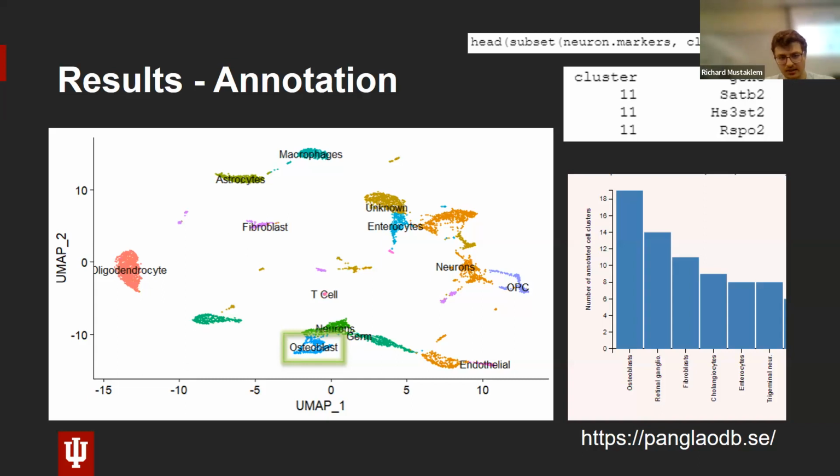So like astrocytes and macrophages, see how they're isolated from the whole group, but they're kind of related to each other though. And you can even see this little section in here where they're kind of connecting. That could be, in and of itself, something that you want to investigate because they're completely isolated, yet they're so close together.